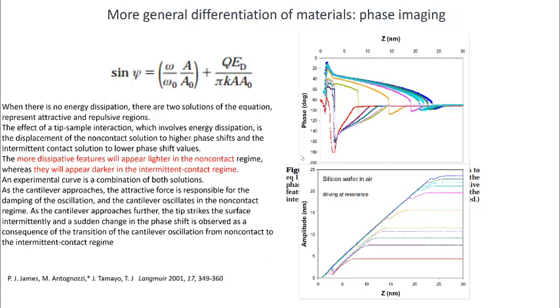Here, it's quite complicated, but in order to understand it, we're going to simplify the story to this point: if we use a very high drive to drive the tip to engage the sample for high force tapping, a stiffer sample region will give you a steeper spring constant, and therefore will cause the phase image to shift more positive. In other words, if you do hard tapping, the phase image can resemble a stiffness mapping of the sample.